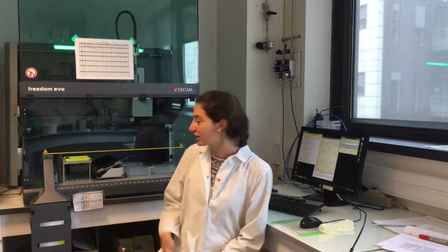Hi, my name's Brielle Weiner, and I'm part of Act 2, which focuses on the prevention of infection transmission. So mainly what our research is that we'll be building thin layer by layer films out of polyelectrolytes, and then we'll be loading those films with antibiotics to test them against bacteria, to see their effectiveness and really optimize their conditions. And so the main way that we can build the films is with this deposition robot that you can see behind me. And so right now you can see it working.